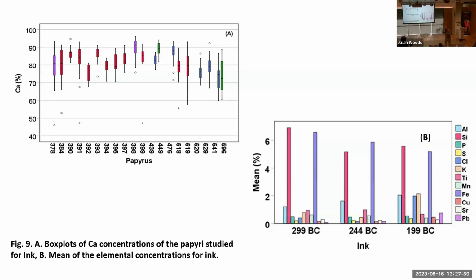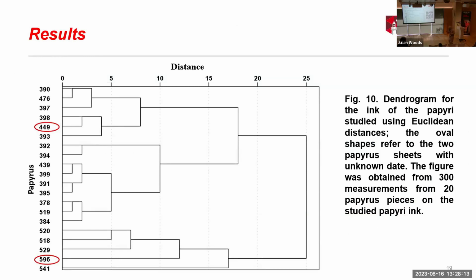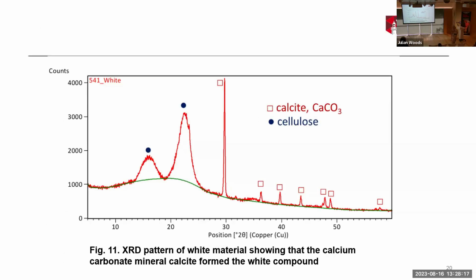So I searched for what I should do. I need to understand the mineralogy, and I am not able to with this. Okay, X-ray diffraction can help us. I took the sample and made an analysis using X-ray diffraction, and this is the result. X-ray diffraction gives us the mineralogical composition. For example, with food salt, sodium chloride: if I use X-ray fluorescence, it will give me sodium, but when I use X-ray diffraction, it will give me sodium chloride. That is why I used it. And I found that this white material is calcite, so now I can understand the technology.